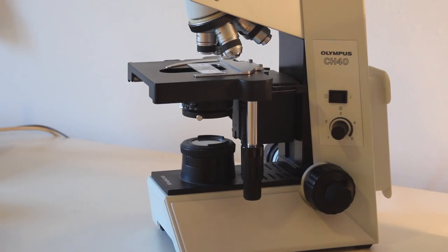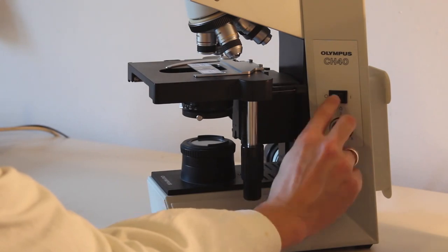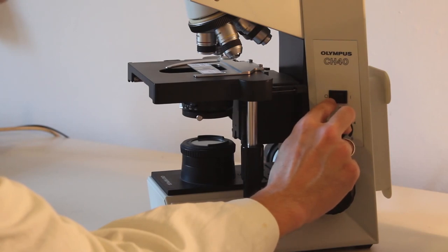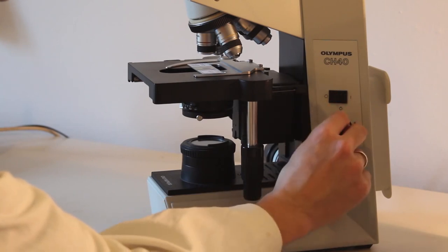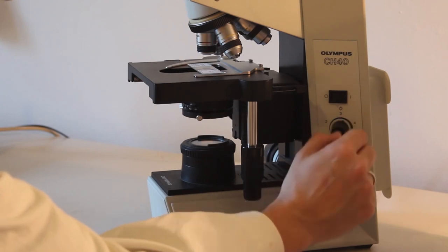We are now ready to go and can turn on the microscope. Always make sure that the light intensity is set all the way to low before flicking the main power switch. This is to prevent the cold light bulb from receiving a high electrical voltage, which may break the light bulb. So turn the light intensity all the way to low, flick the switch, and then gradually raise the light intensity.